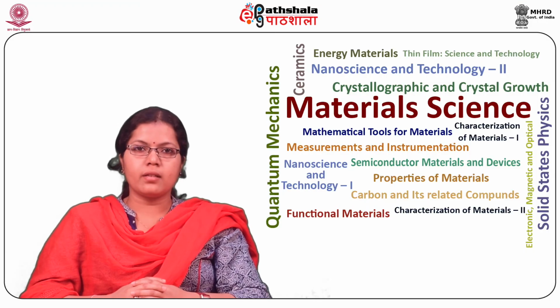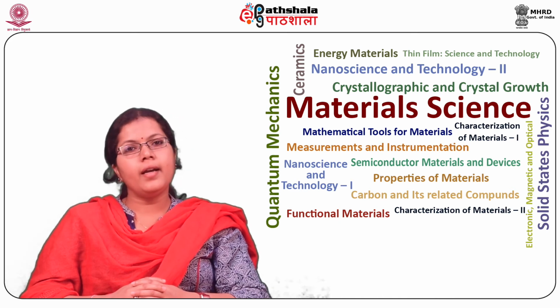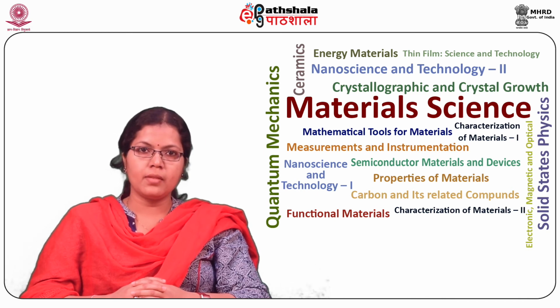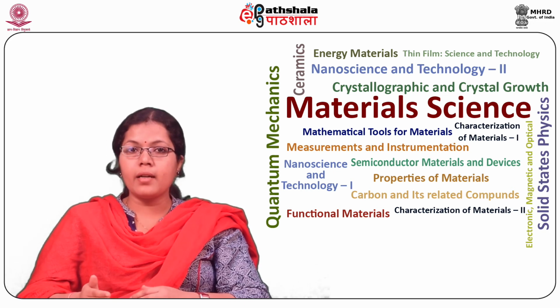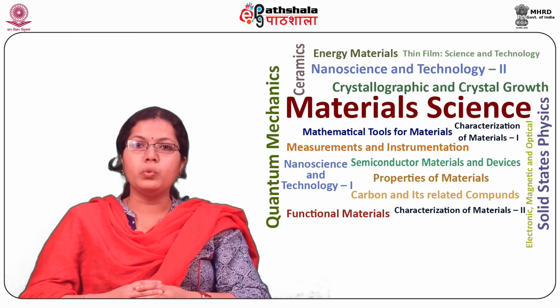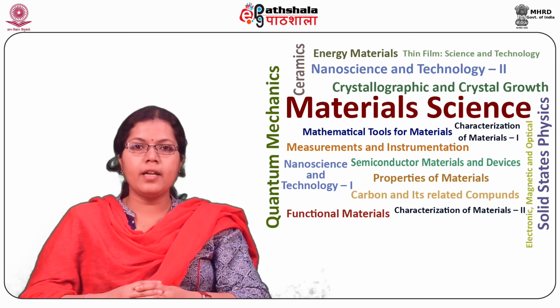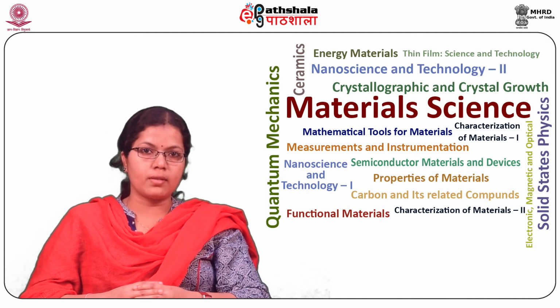The ET detector is schematically illustrated in figure 7. It is basically a scintillator photomultiplier system. The secondary electrons are first collected by attracting them towards an electrically biased grid at plus 400 volts to plus 500 volts, and then further accelerated towards a phosphor or scintillator at about plus 2000 volts.